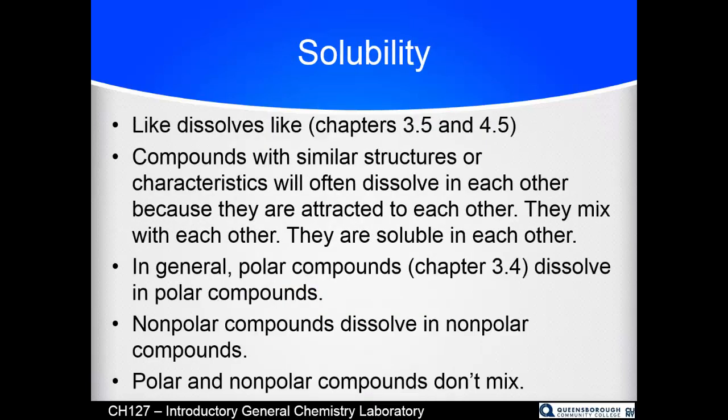So to talk about chromatography, which is a separatory technique, not an identification technique, unless you have something to match it to. If you have a known compound and you run it right next to your unknown compound, and it's an exact match, then they're highly likely to be the same thing, but not necessarily, just like all the other techniques that we've looked at. It's a single data point, and so you can't bet your life on one data point, or you probably shouldn't.